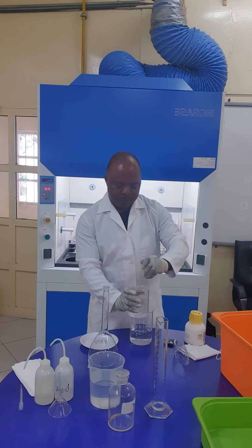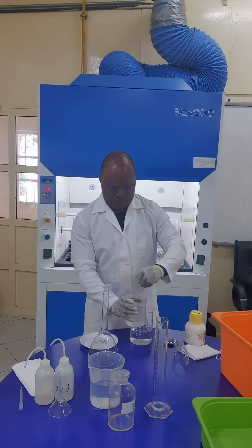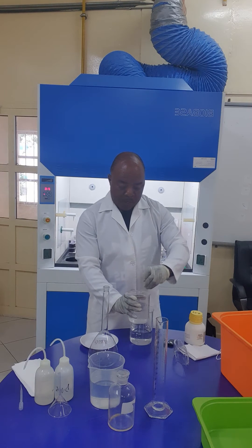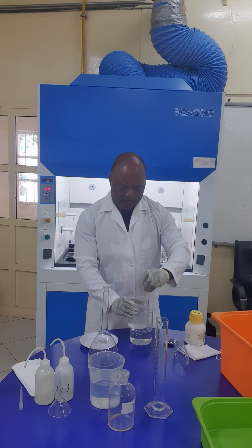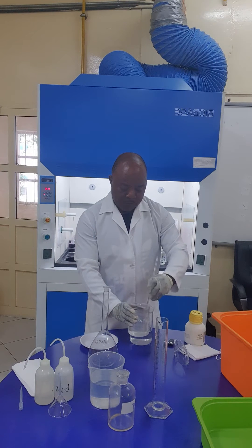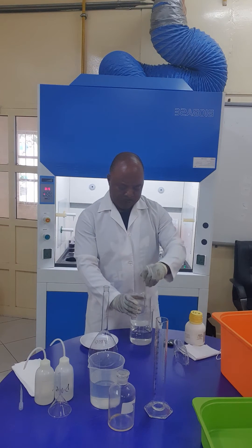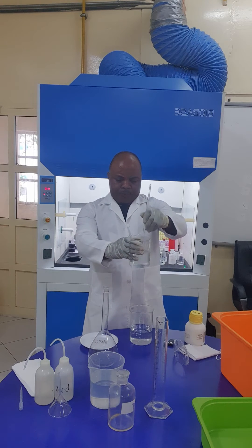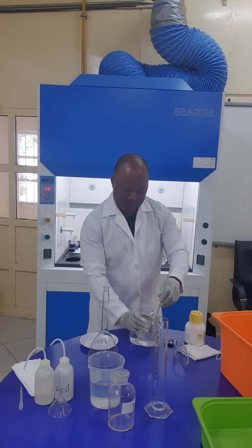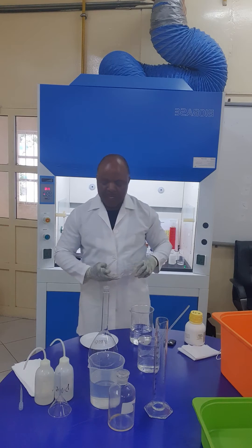A little portion should be taken. Heat is being generated. As I earlier said, this is also an exothermic reaction. Caution should also be taken because it is corrosive, even though it is mild. So a lot of precaution should be taken in the course of this. The sodium hydroxide pellets are all dissolved.